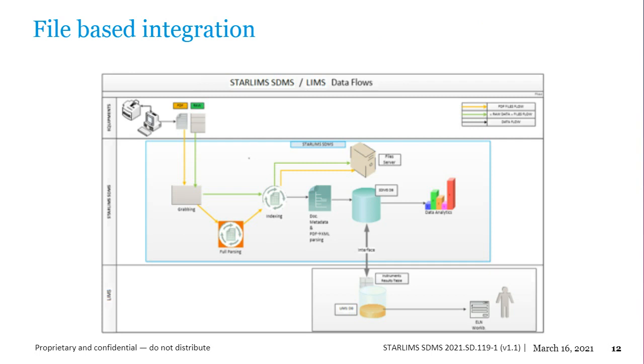Let's move on to file-based integration. For file-based integration, the SDMS includes various dedicated parsers for the most common document types, such as PDF, Word, DOC, DOCX, plain text, your text files, your CSV files, Excels. So these are all covered.